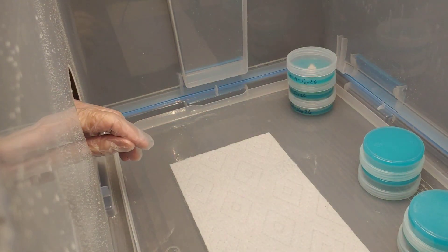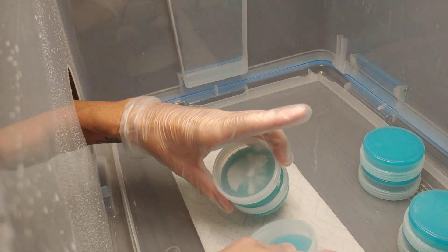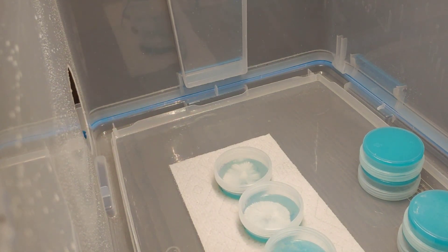And that's it. I just wanted to show you the progress and I will show you also a time lapse of these growing right now.